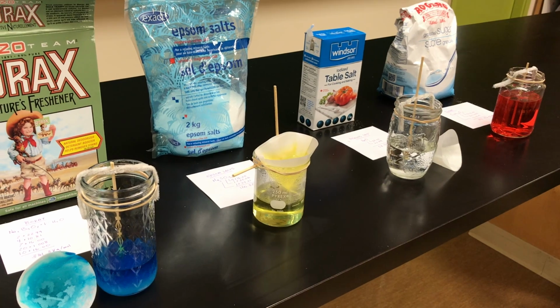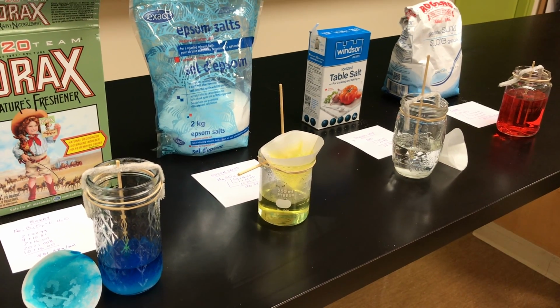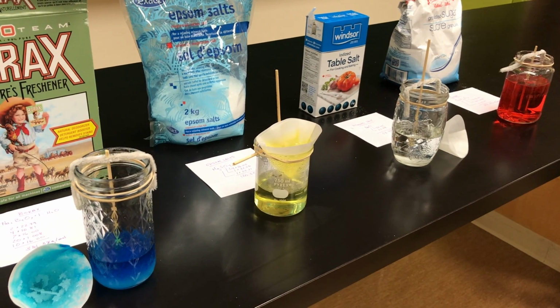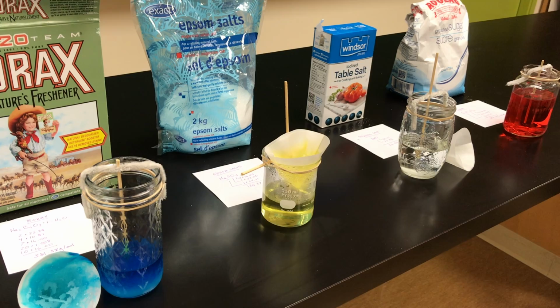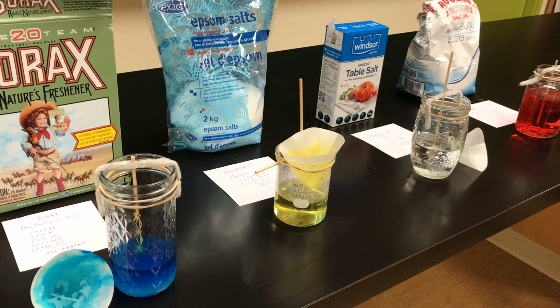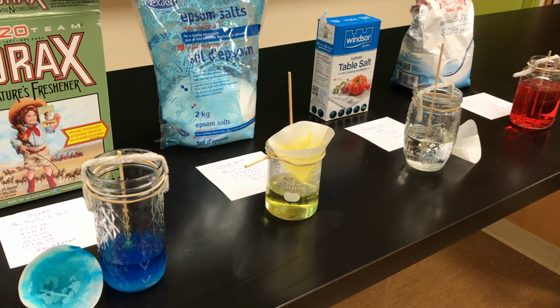So I got curious. I was just going to do the sugar into the super saturated solution, but I got really curious and wanted to try them all. So I've just finished prepping up all of the solutions, first attempting a saturated solution. Pretty much across the board, I felt like I had more solute than was required, but my room temperature was also cooler than 20 degrees, so that could be a contributing factor.